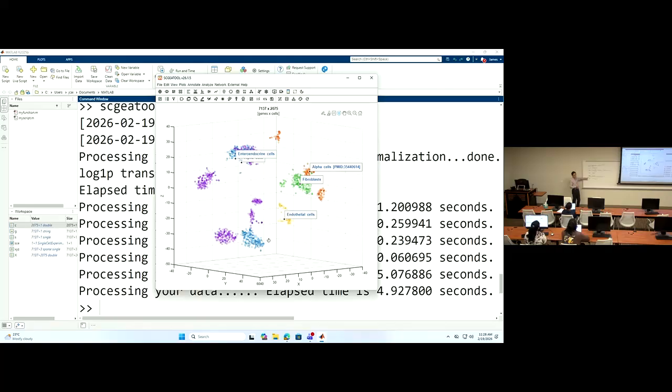Okay. If you don't want to do that, you can have all the individually clustered, and then you look at each subgroup, slowly merge them.